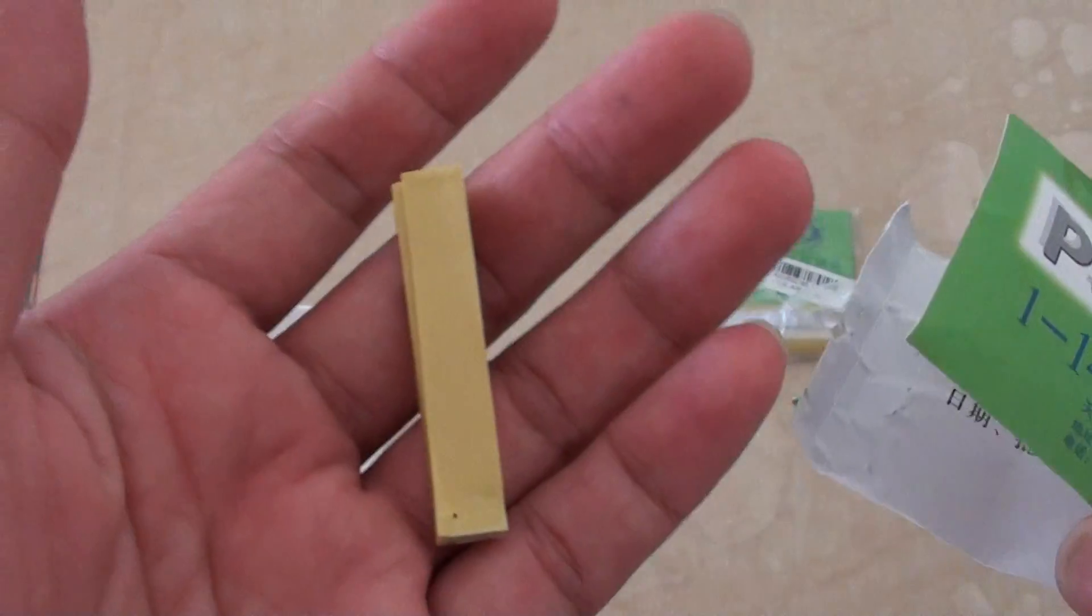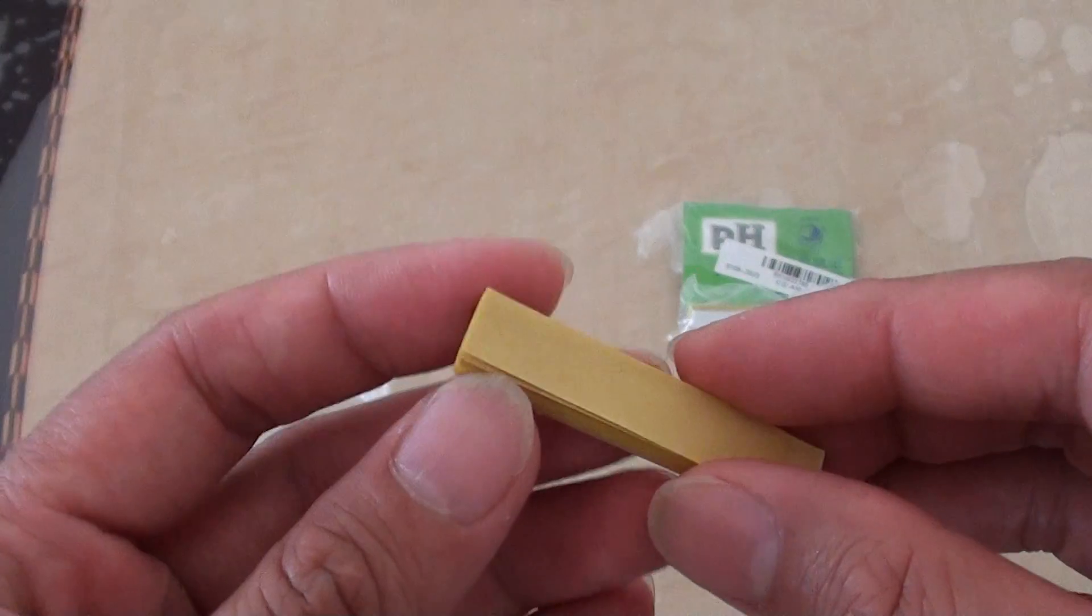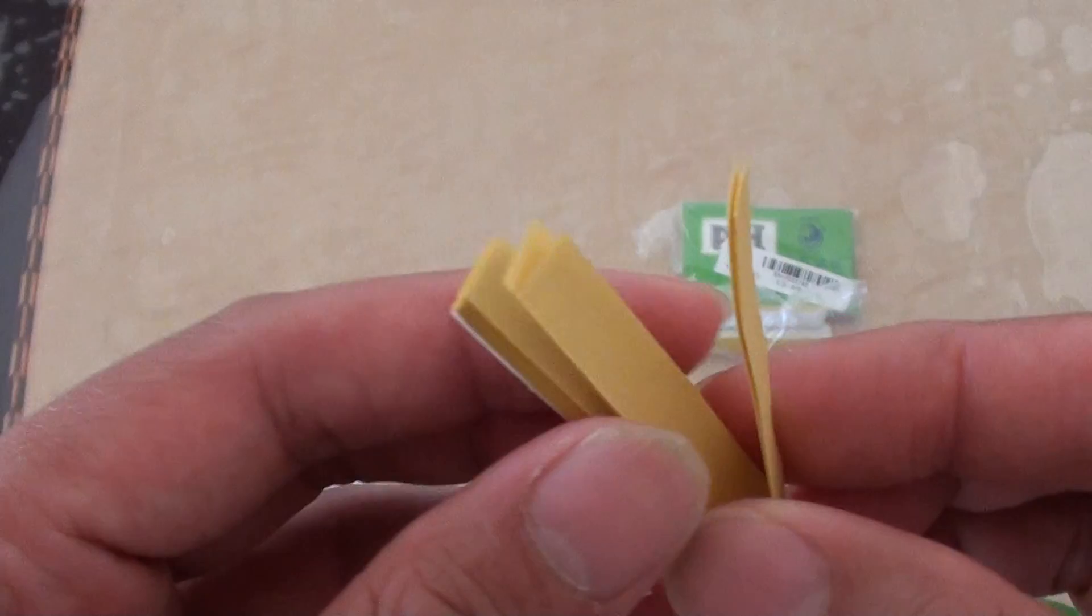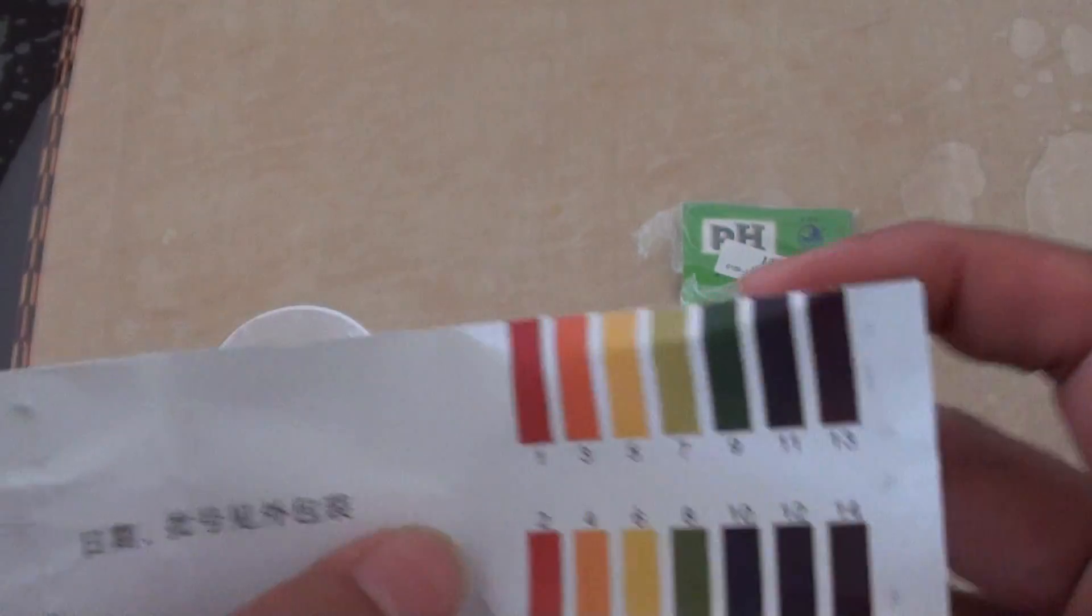Basically, once you've got this paper, you can dip it into your saliva or urine. It will come out with different colors. And based on the color, you can use the chart to see what you're getting.